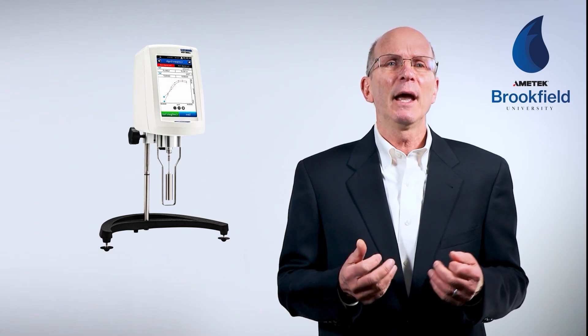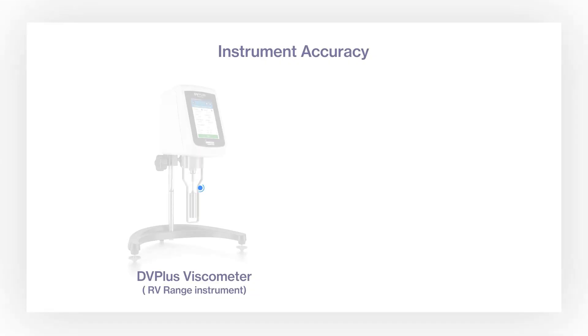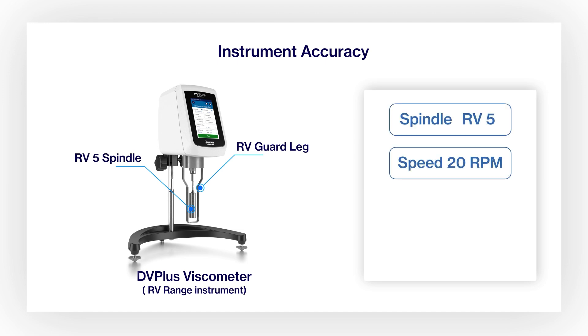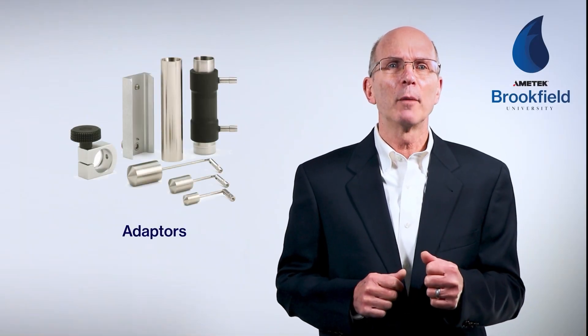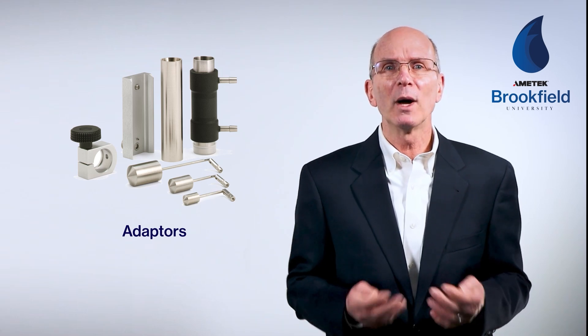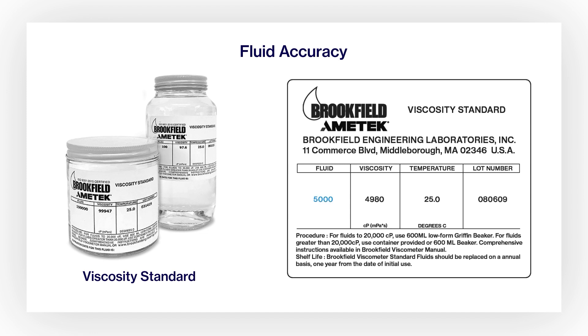When performing a calibration check procedure with standard spindles, always use the guard leg in a container with a minimum diameter of three and one-quarter inches — a 600 ml low-form beaker meets this requirement. Using an RV range instrument with an RV5 spindle at 20 rpm, the full-scale range is 20,000 centipoise and accuracy is 1%, or 200 centipoise. Note that if using coaxial cylinder geometry like the small sample adapter, thermocell, or UL adapter, the accuracy becomes 2% rather than 1%. The viscosity standard label states both the fluid item number — 5,000 centipoise — and the actual viscosity of 4,980 centipoise at 25 degrees centigrade.